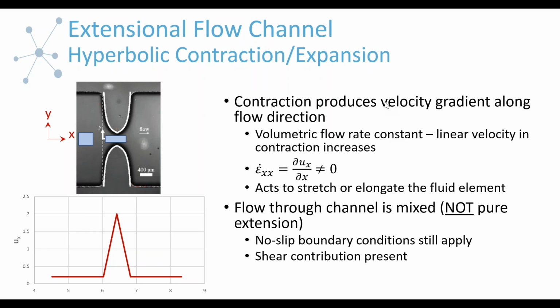Someone's asking about measuring a polymer in aqueous dispersion, and they're concerned that it might get stuck in the hyperbolic contraction. We can provide you all the dimensions again, and the general rule is that any dimension of particles or aggregates would need to be less than 10% of the smallest dimension. So there should be no problem with testing so long as that's the case.